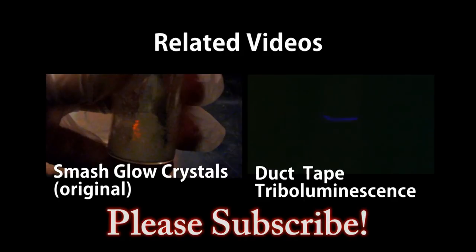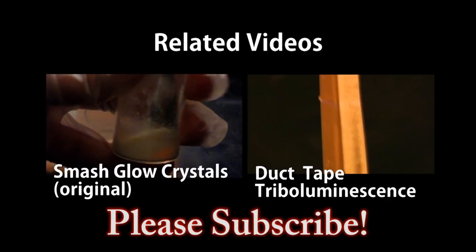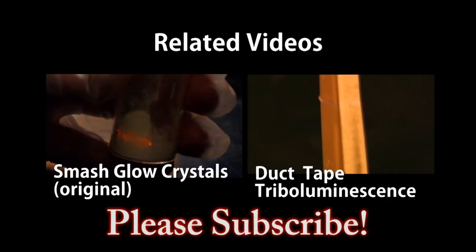In this video we'll show you very weak triboluminescence at home with duct tape. In this video we're going to make triboluminescence or smash glow crystals.